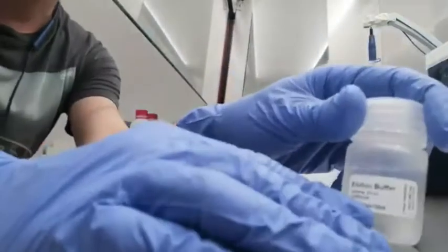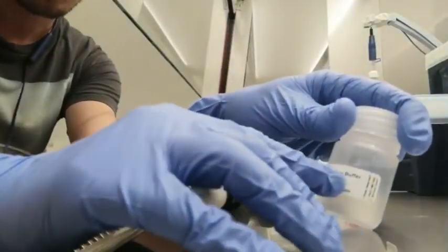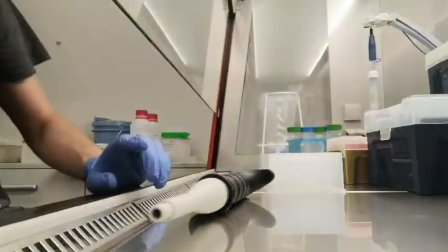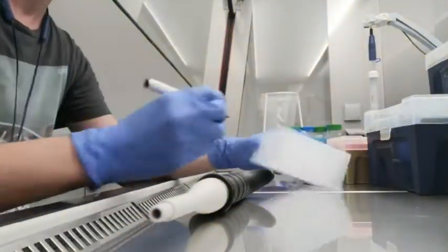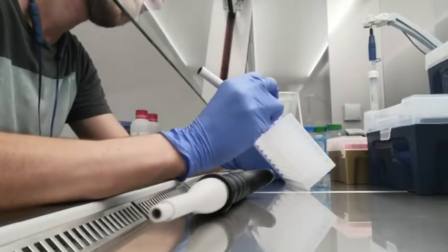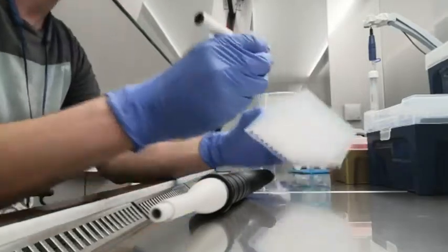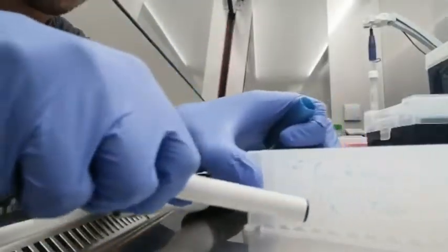Lastly, take a fresh plate and pipette 200 microliters of elution buffer into each of the wells that contain the samples. This will be the plate that holds your final sample.